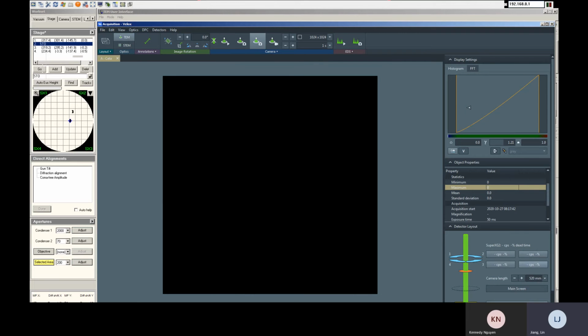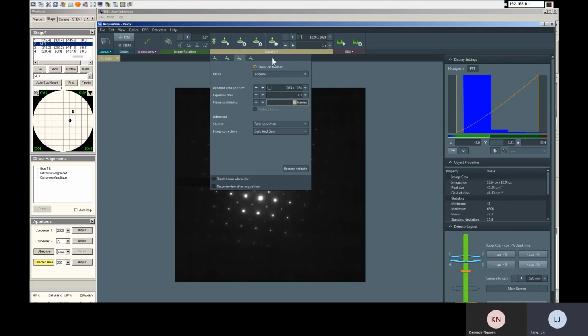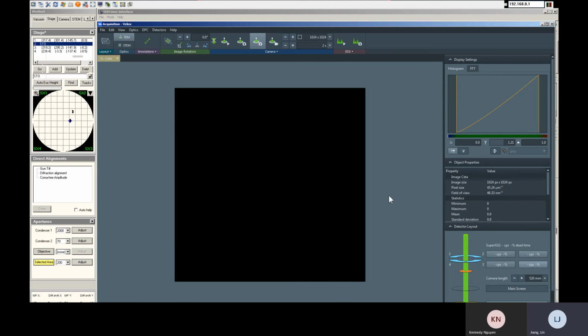So, and then you go acquire this image you get. In this case, you're not going to overexpose your camera. If you find this exposure is not good, you need to further increase the contrast. You can go for more frames. You can go 2 seconds, 40 frames. Actually 38 frames, and then you get another image.